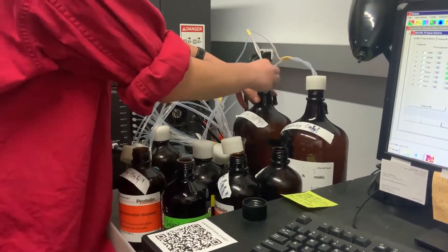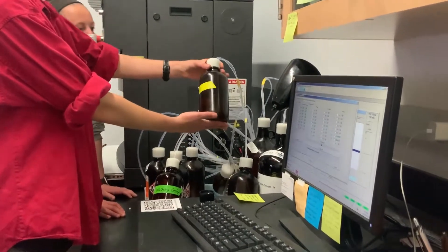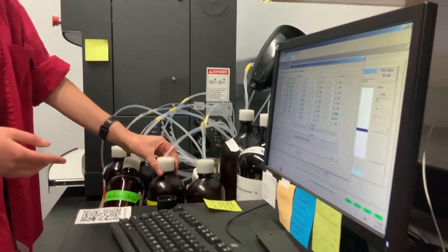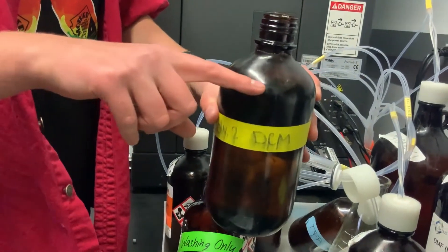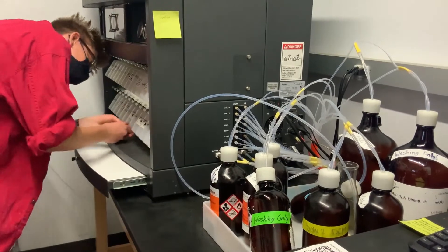During a system clean, DCM is run through all of the lines to wash out any residual reagents and clear out any clogs in the lines. The DCM bottle therefore needs to be full before any system clean. Make sure all of the amino acid bottles, reaction vessels, and reagent bottles are in place and completely sealed.